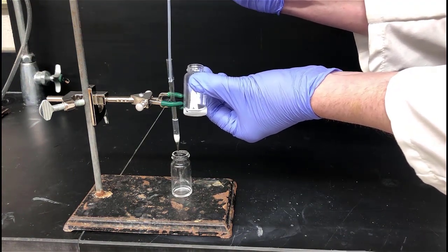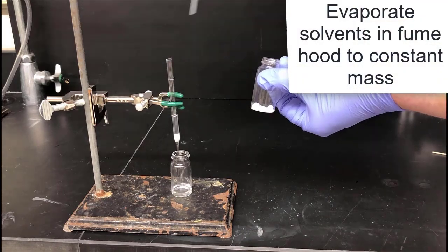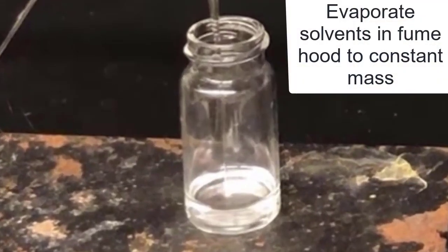When the filtration is complete, we'll need to remove the solvents. Bring the vial over to the fume hood and blow a gentle stream of air into it while you heat it on a sand bath. We'll know that we're done with the evaporation when the vial stops changing in mass. So periodically put it on the balance, weigh it, and see what its mass is. When it stops changing, you'll know you're done.